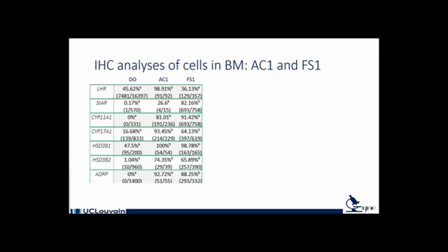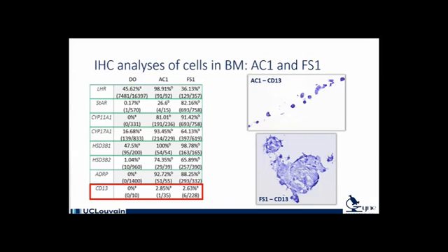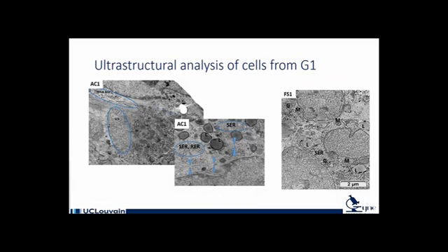We were very astonished by these results, and we decided therefore to perform CD13. As you see here, CD13 for attached structure is 2%, and for floating structure is also 2%. It is the marker for theca cells, so it is not expressed.